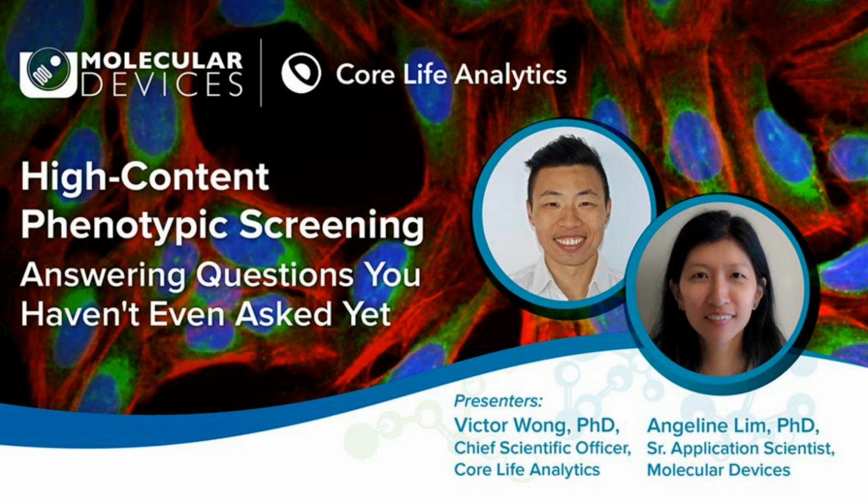All right, thank you. Next question. Regarding the image analysis, how long does it take to analyze a plate? Let me answer that question. So for the initial image analysis part of the workflow, in the software, you can take about 3 hours to analyze a 384 well plate that's imaged with 6 channels and 4 sites per well. The time changes depending on how complex and how many steps you want to add into your analysis protocol. So, for example, if you use a lot of deep learning models, that would take more time.